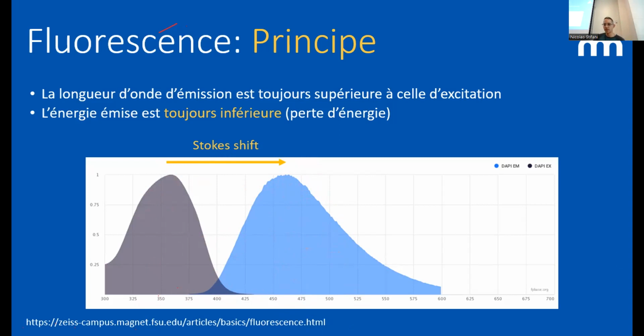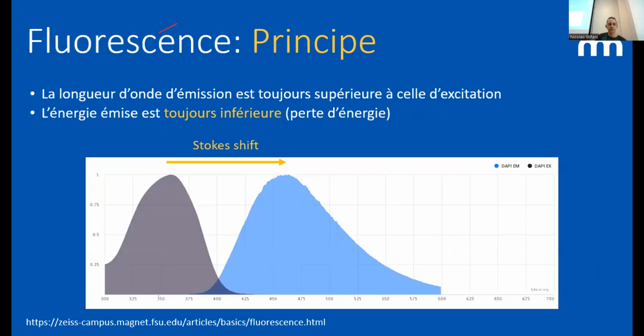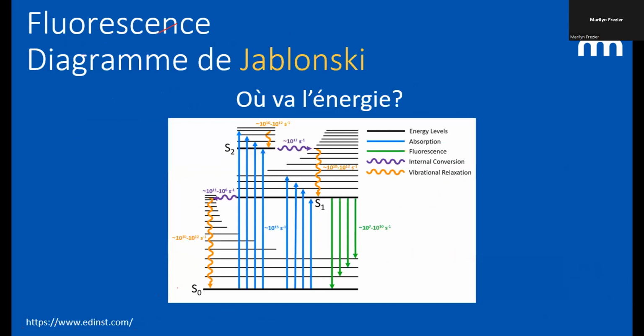If I translate the question, quantitative fluorescence microscopy is dependent on the intensity of fluorescence that you send, like excitation time. So if we go to the slide before, Marilyn is saying that if you want to measure quantitatively how many photons are emitted, you need to know precisely how many photons are getting in. And this is totally right. And I agree with you. I don't know if you ask more questions on that.